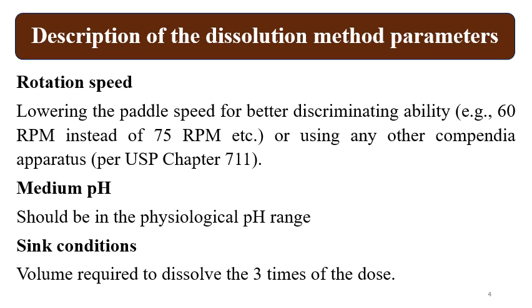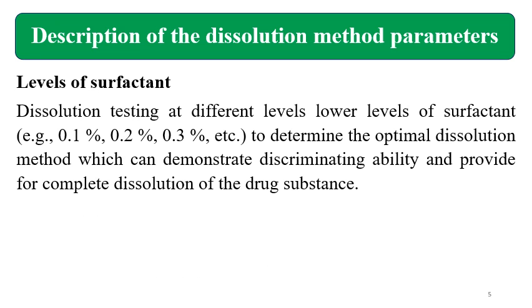Sink condition is generally not mandatory, but it is a recommended condition. If the applicant is not able to achieve sink conditions, more justification is required to be given.